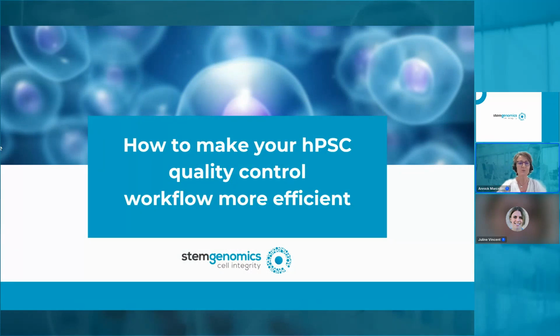Okay, but let's get into today's topic. Scientists like yourselves working on pluripotent stem cells, when it comes to building a robust quality control workflow, have a series of norms and standards you can follow. One of them is the OECD guidance document on good in vitro method practices, which will help you with the regulatory use in human safety assessments.